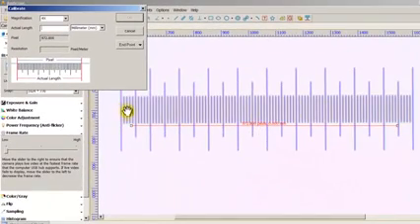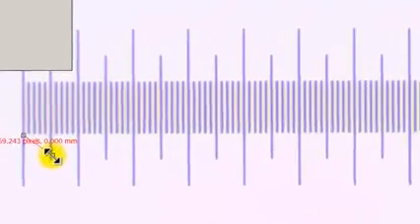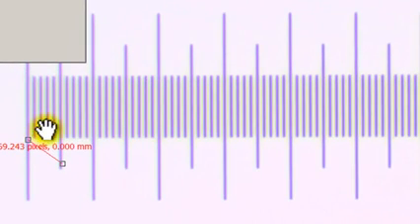So each individual line, even the small ones here, not just the big long lines here, each of the small lines is 0.01. So if I were to measure from, let's say I grab this point over here and drag it to the middle line right here, this is basically 0.5. Okay, so just to be a little bit more accurate, and make sure that I'm a little bit closer to what I want, I'm gonna go ahead and do something a bit closer. So it'd be 0.1, 2, 3, 4, 5. So this would be 0.05.